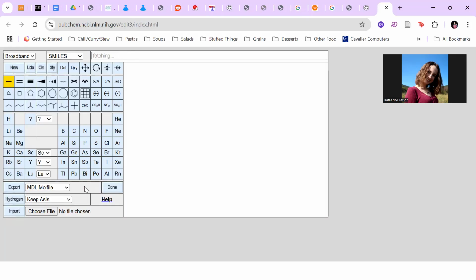So let's draw this out to illustrate everything that we've seen. So we'll start with the aromatic ring. That's easy. And then we'll add a single bond here. All of the other points on the ring are going to count up to 5. So we have our 5 hydrogens, which explains the integration we saw on our 1H NMR. So that checks out there. In terms of what carbon is going to go at the end of the single bond, we have two choices.